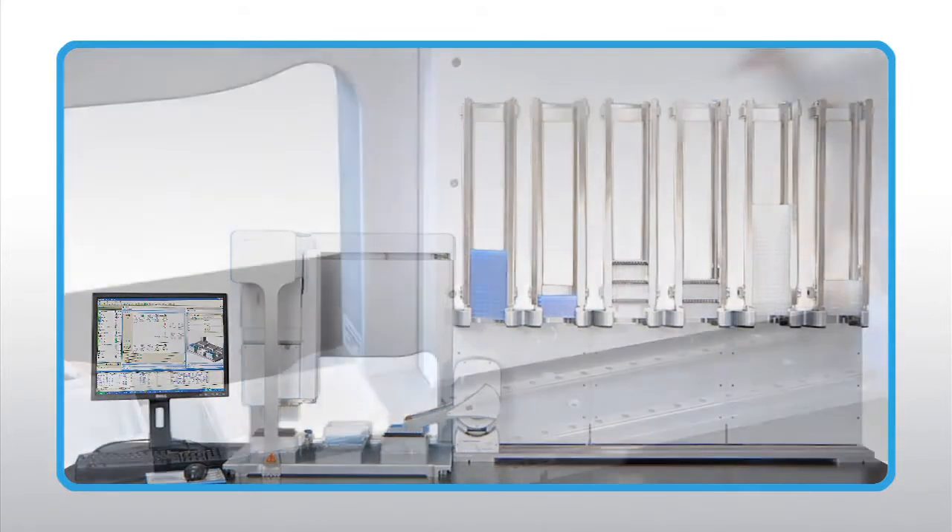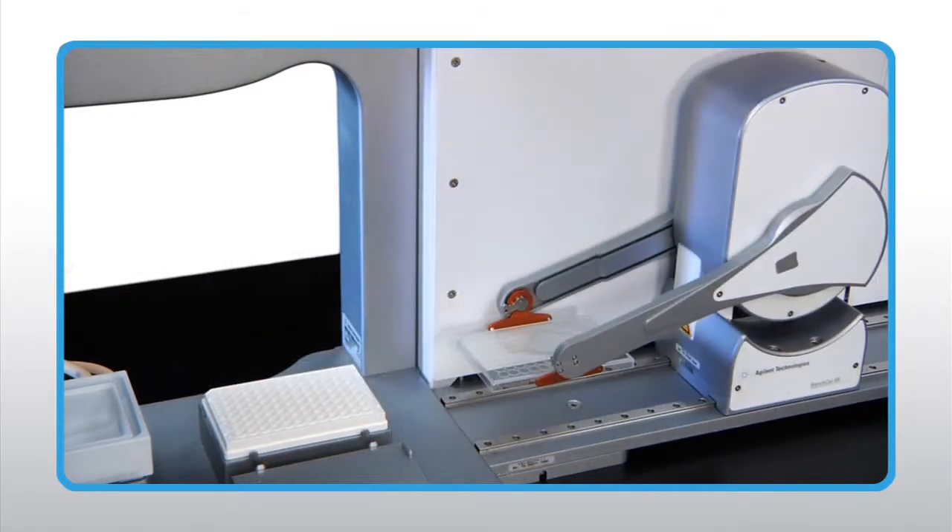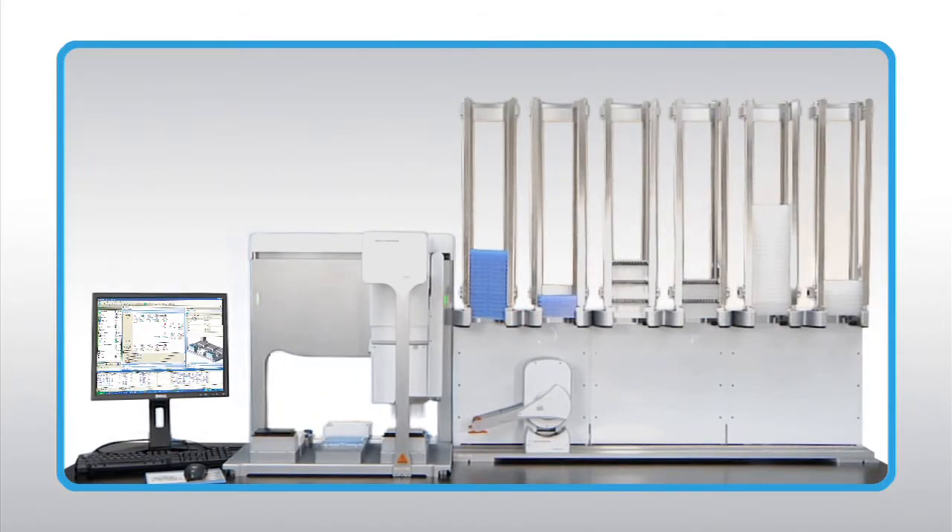Advanced automated functions such as de-lidding enable more complex protocols. Loading and unloading labware is quick and easy.